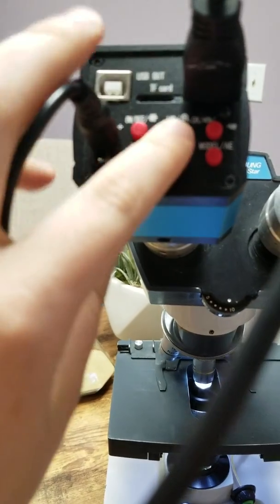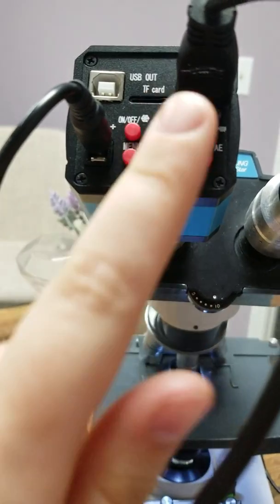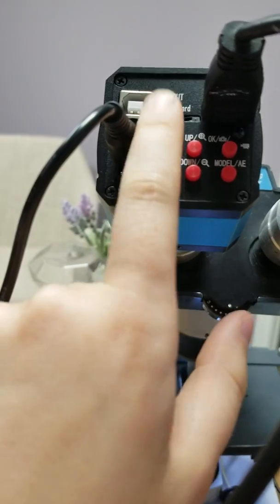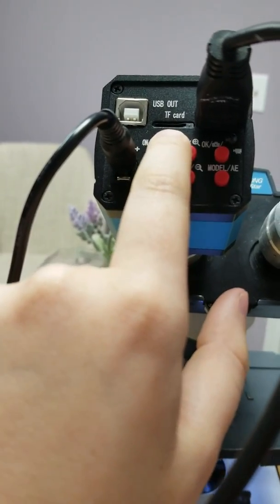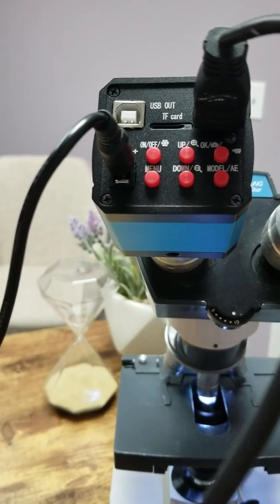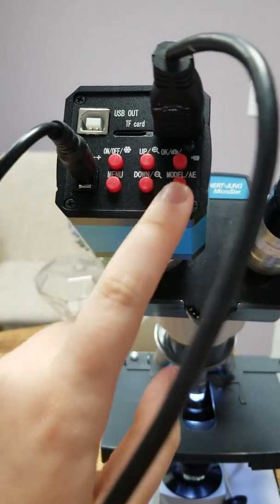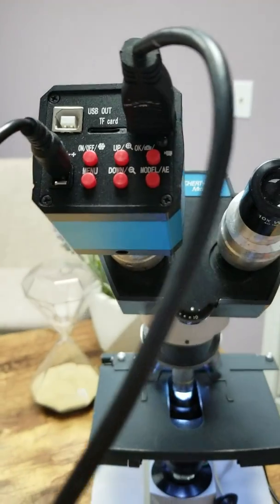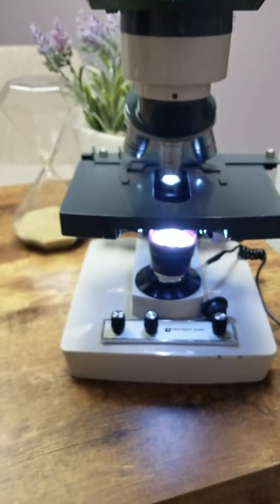You can even zoom in and out here. You can have a little TF card to save any pictures or anything like that. And then you would just take the picture with this button. So it's really perfect.